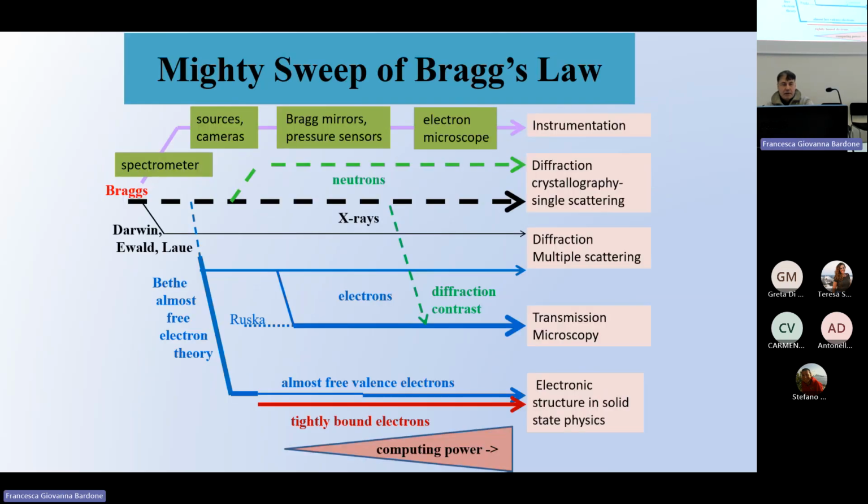So from the Bragg law, we have all these types of instrumentation. From the principle of the diffraction limit from Bragg, we have all these different instruments. Today, I will focus mainly on electron microscopy, but to be clear, also to think about other experiments, for example in biology, you can have other facilities for other types.